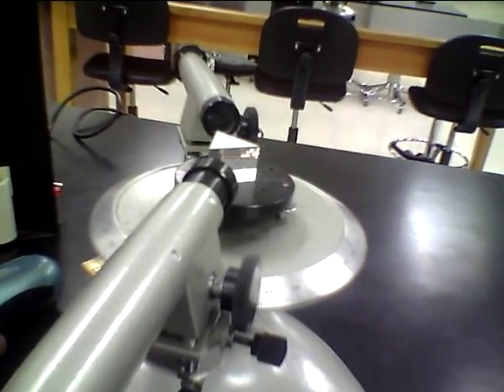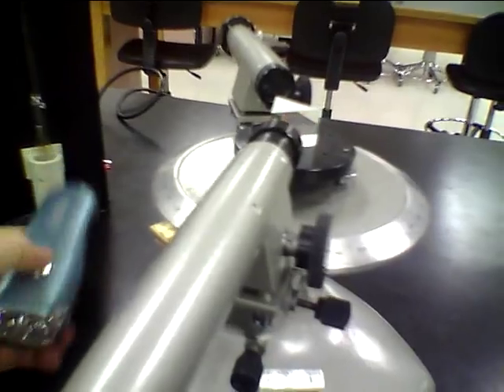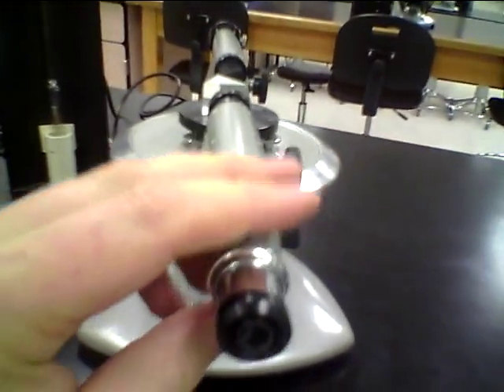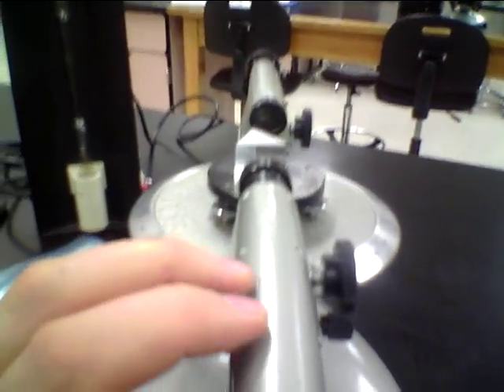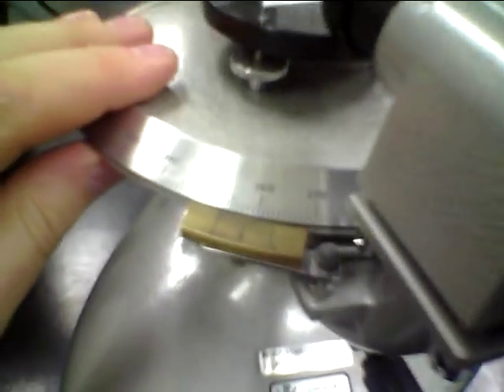We're going to go through the calibration steps for the spectrometer. First of all, we want to make sure that the table is lined up for the students. The instructions have to be written in such a way that they can all navigate through the table. This is at about 253.5 in the lab menu, and it tells them to put it at 252.